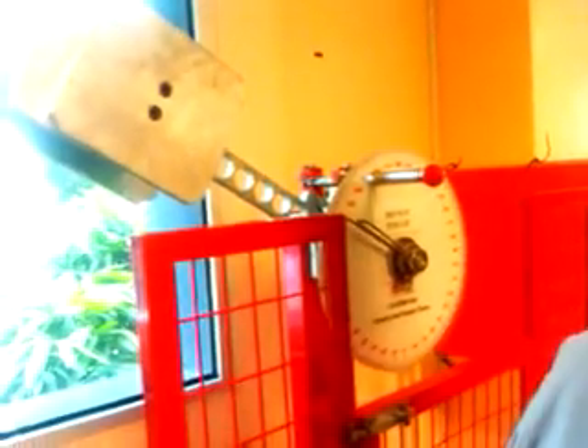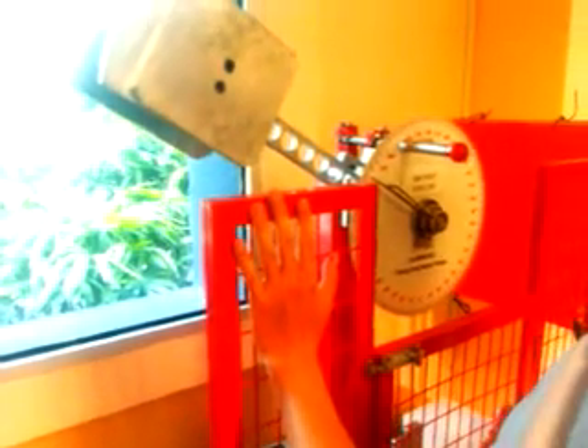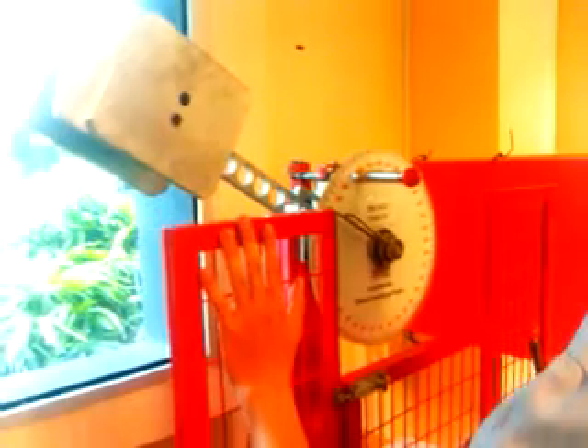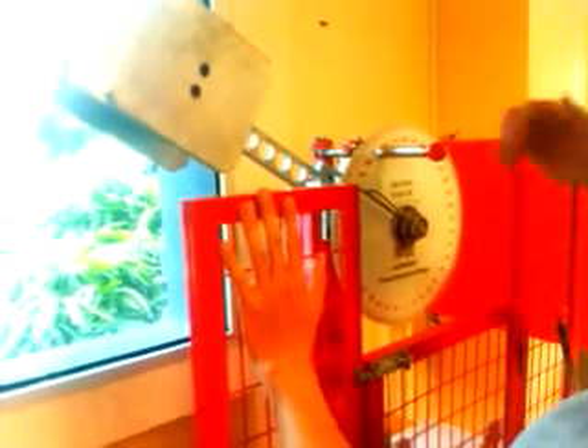You have to balance your body because you will use your right hand to release the lock. You can put your hand on the gate here to balance your body momentum. Don't put your fingers in — unless you have too many fingers. Put your hands here to balance your body momentum and do not be too gentle. Give it a hard push, just one — make it a very hard, fast release.